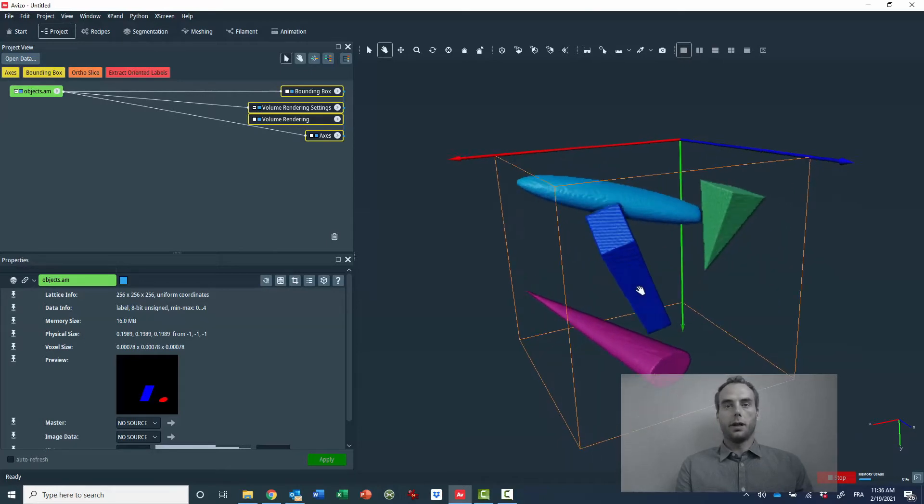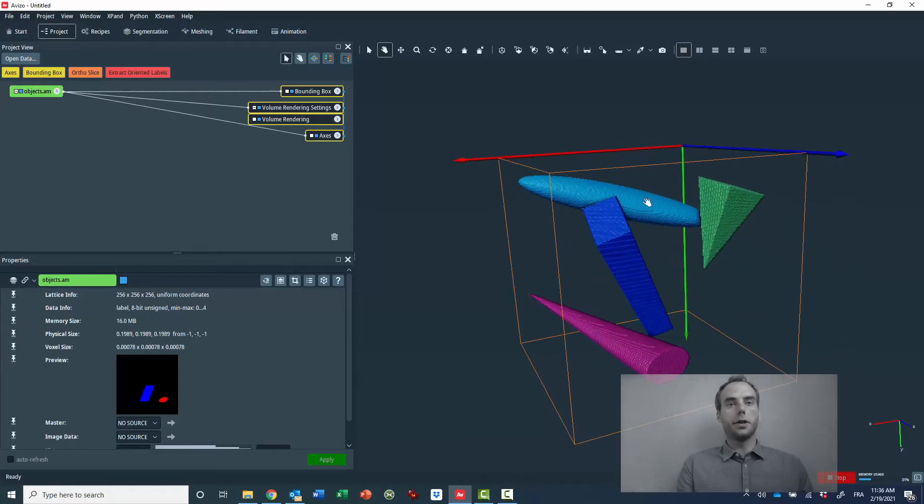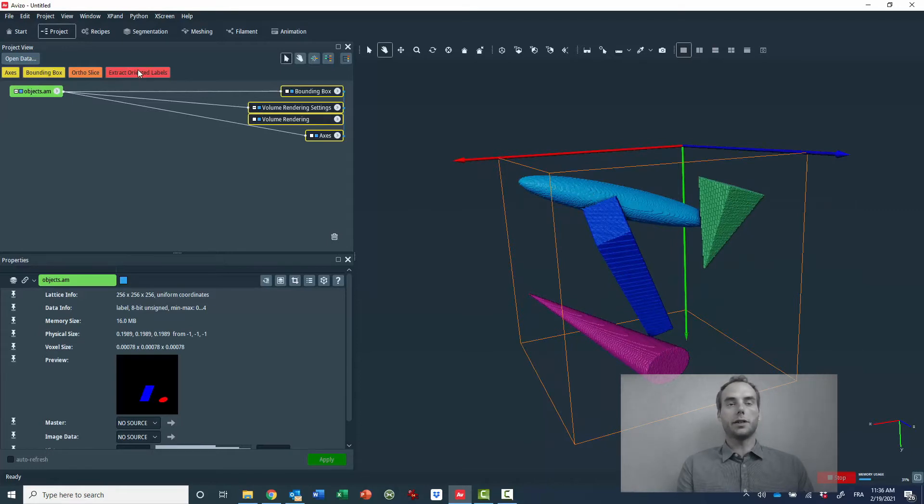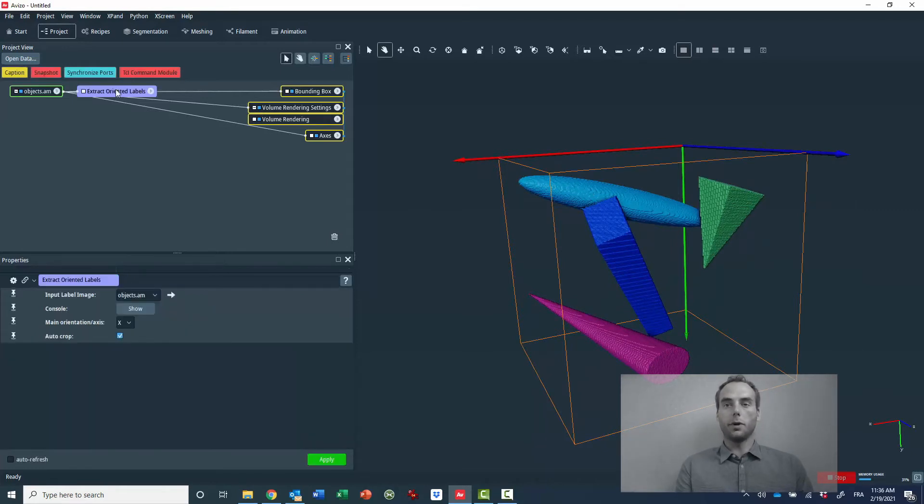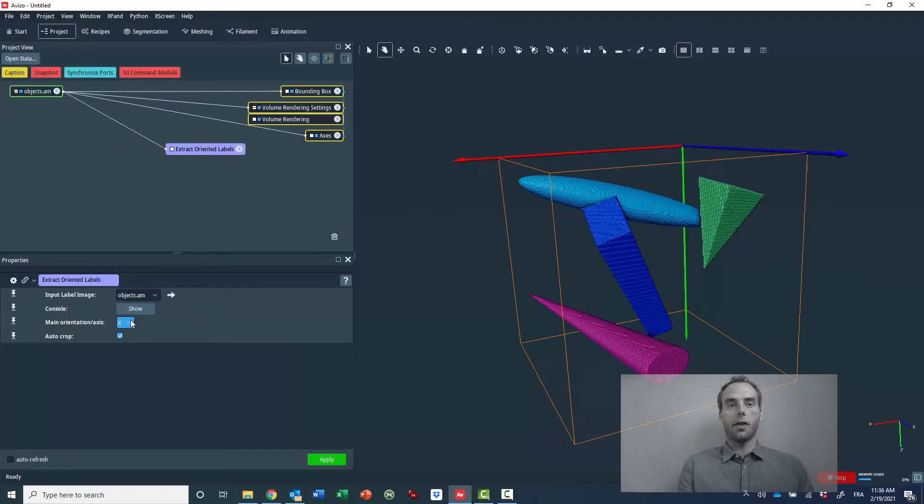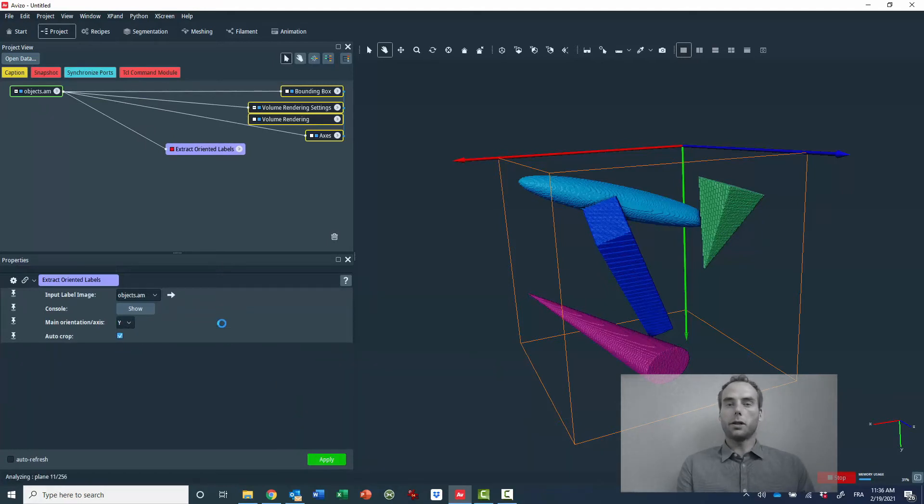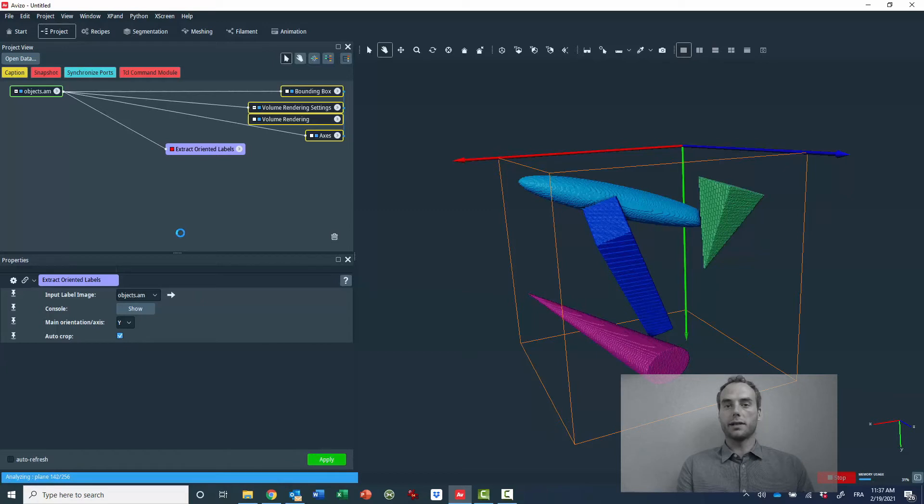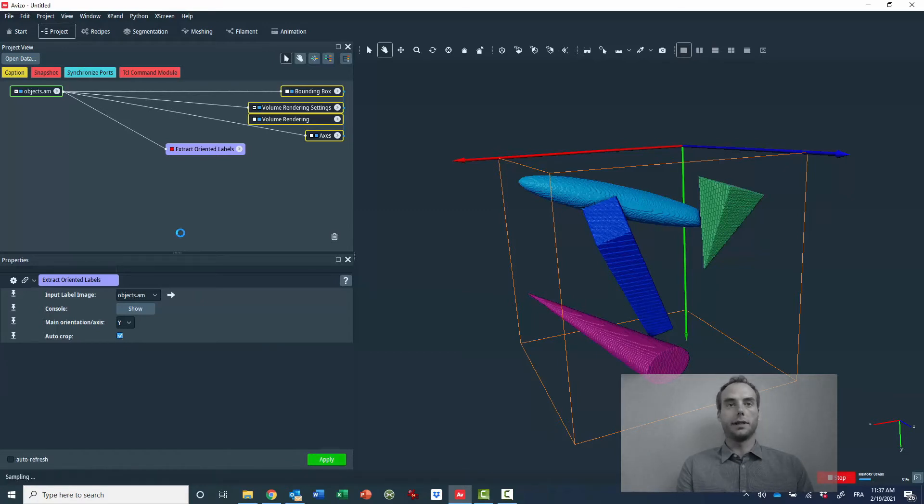And now I will use the Extract Oriented Labels module to automatically extract and resample these objects along their main orientation. Their main orientation will be also aligned with the Y axis of the local coordinate system.